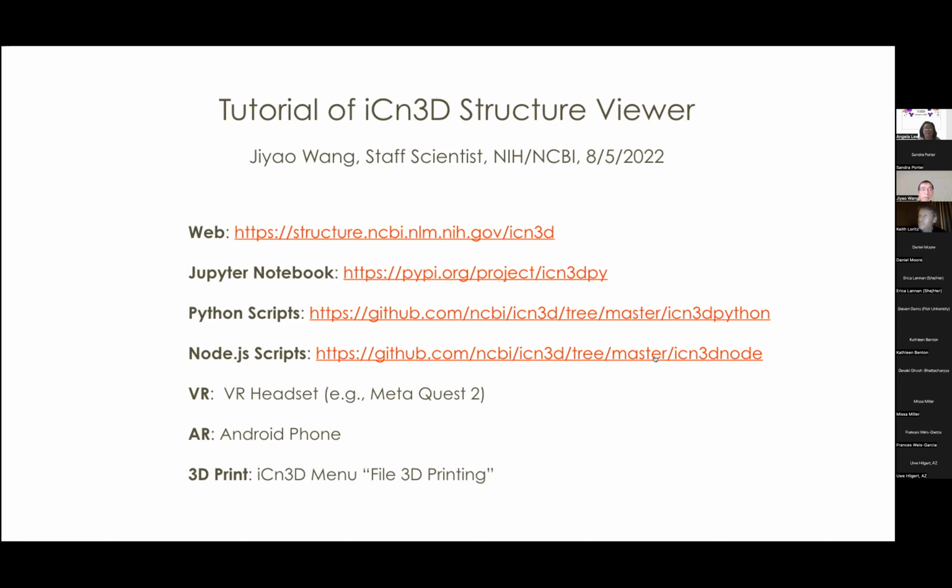Okay, I'll get started. My name is Jiyao Wang. I'm a staff scientist at NCBI. Today I'm going to talk about the web-based 3D viewer called iCn3D.